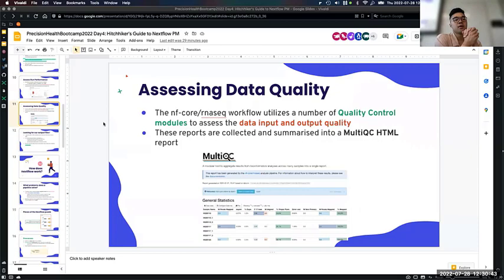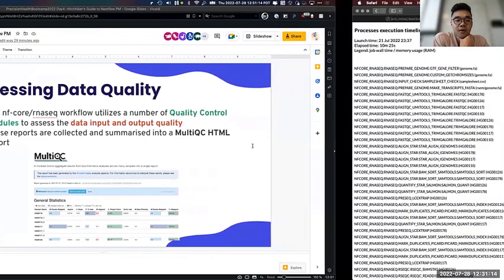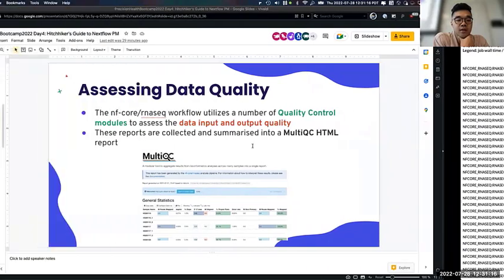Okay, so after you look at the technical performance of Nextflow, you're probably interested in the actual data, which is what you went through all the trouble for in the first place. So those of you who work in bioinformatics are familiar with tools like MultiQC. It's just an aggregating QC report tool that collects all these different QC modules and puts them into a very nice HTML report. So we can use this to peep the quality of our significantly downsampled FASTQs and BAMs.